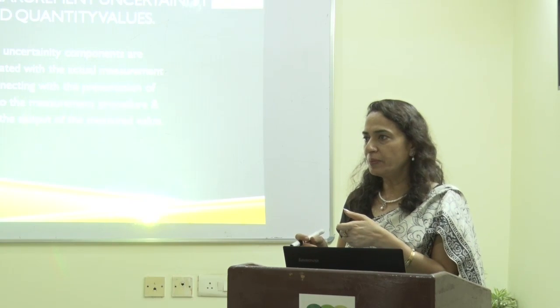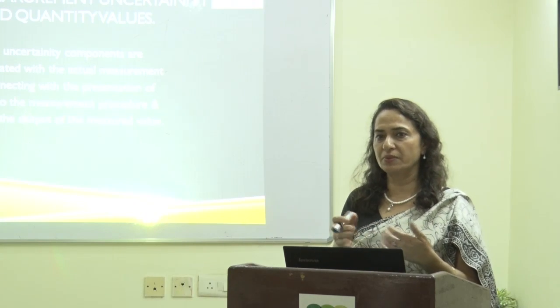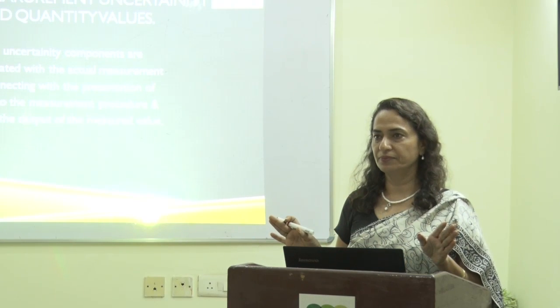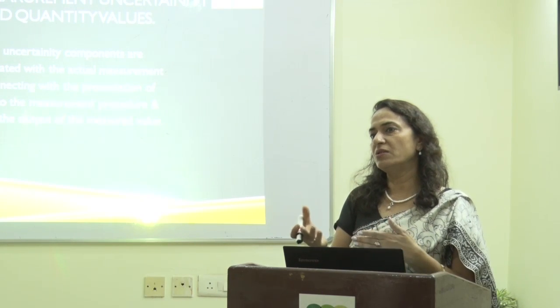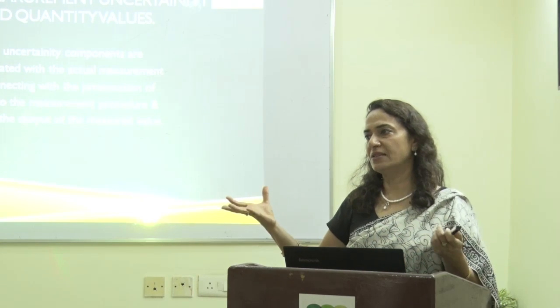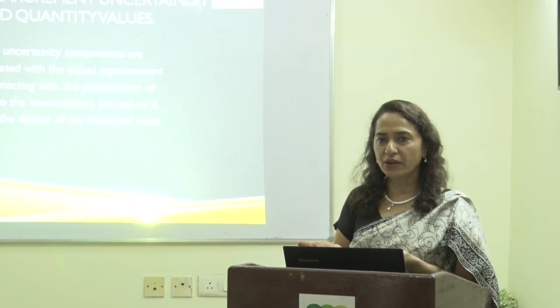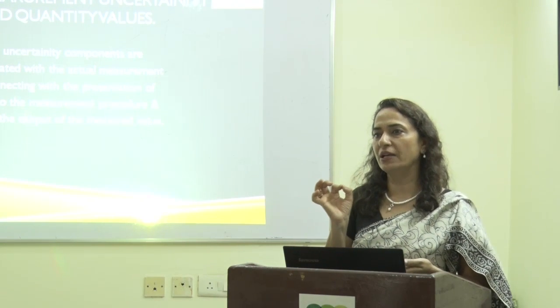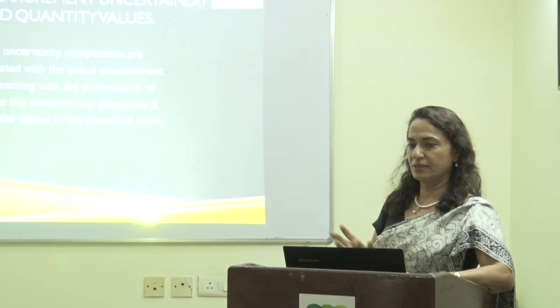When we were doing manual pipetting, uncertainty was more. From one person to another person, one pipette to another, uncertainty is more. With automation, that uncertainty factor is gone. So CV percentages further come down. So advancement in technology is helping us to bring the CV percentages down, to bring the uncertainty factors to minimum, so that we can get more accurate results, so that we can get the true values or the values close to the true value of a substance. Right? So that's the idea of the whole concept.